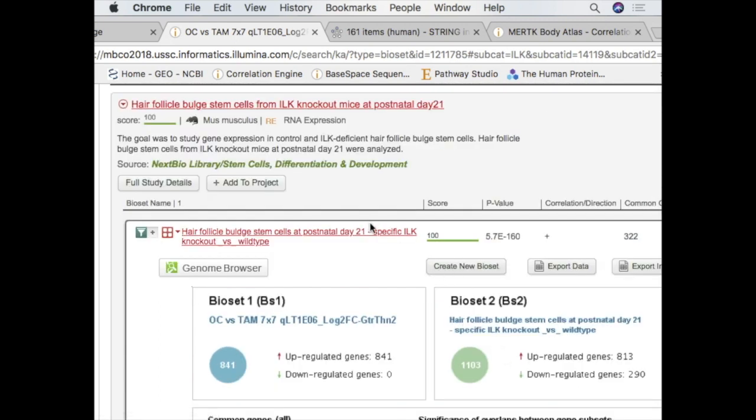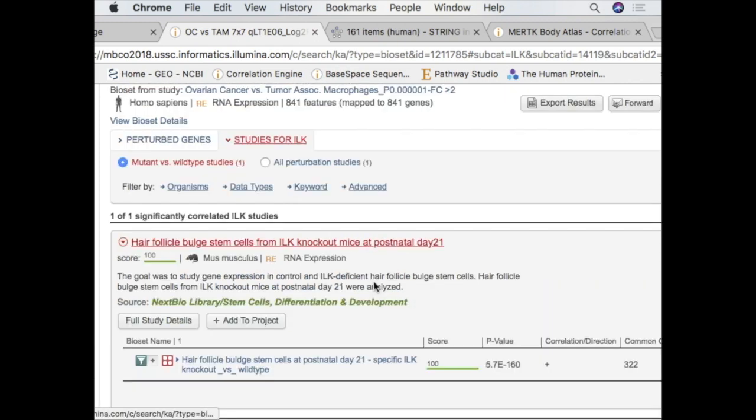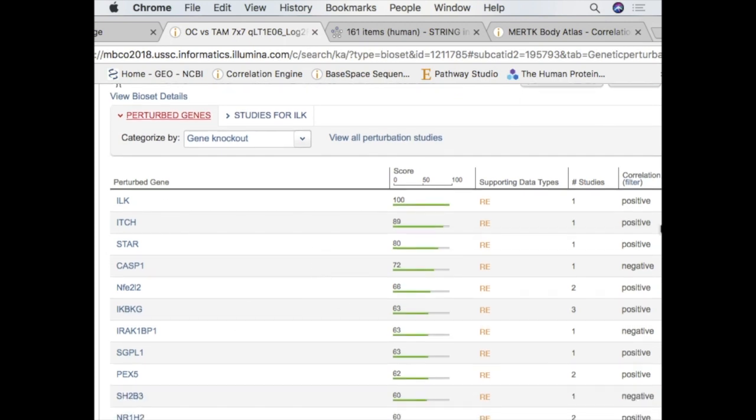Okay. So again, another way to find things that are related to your system that you're not measuring directly. And again, I would argue that these are probably your important, main players in your system. Again, we could look for gene knockouts, we could look for things with mutations, overexpression. If I overexpress a particular gene, does it have any effect on the genes that I put in? Lots of ways to cut this cake. And the greatest thing is, I am not trusting what somebody says about their data. I'm actually mining the data itself. Does everybody understand that?